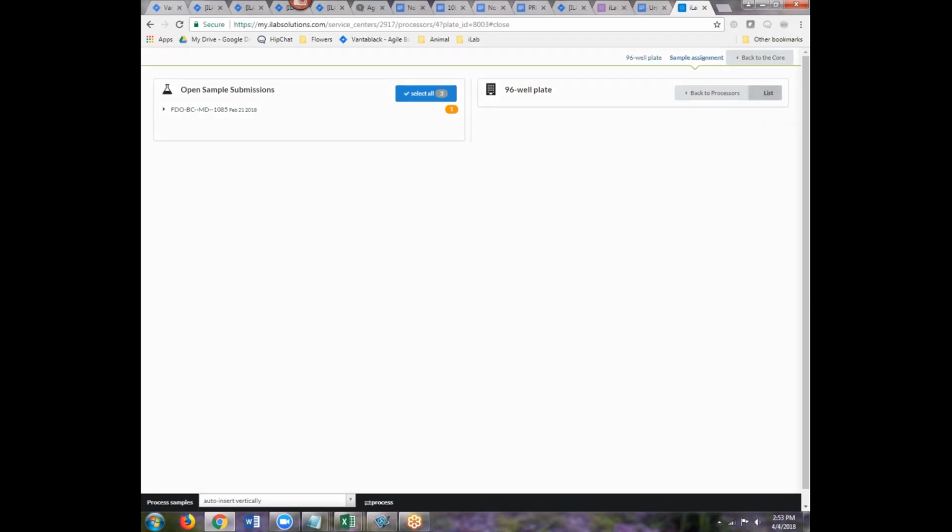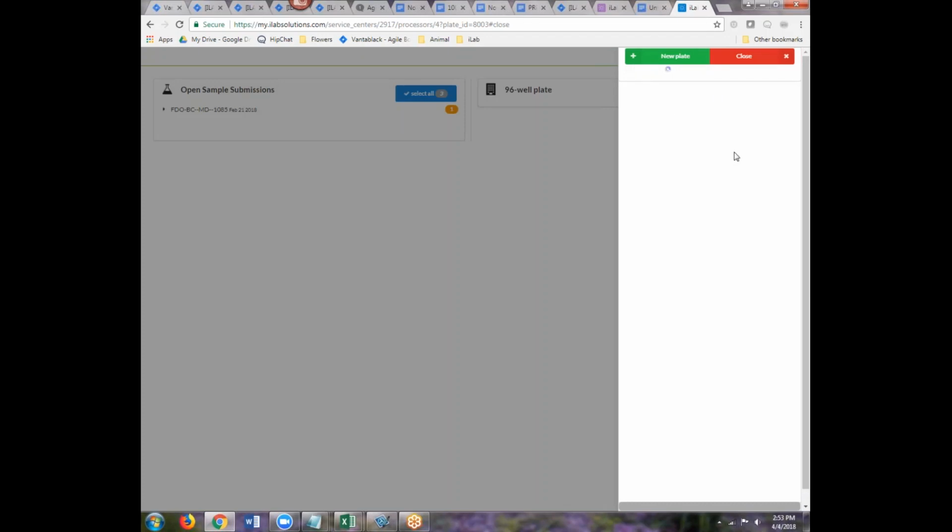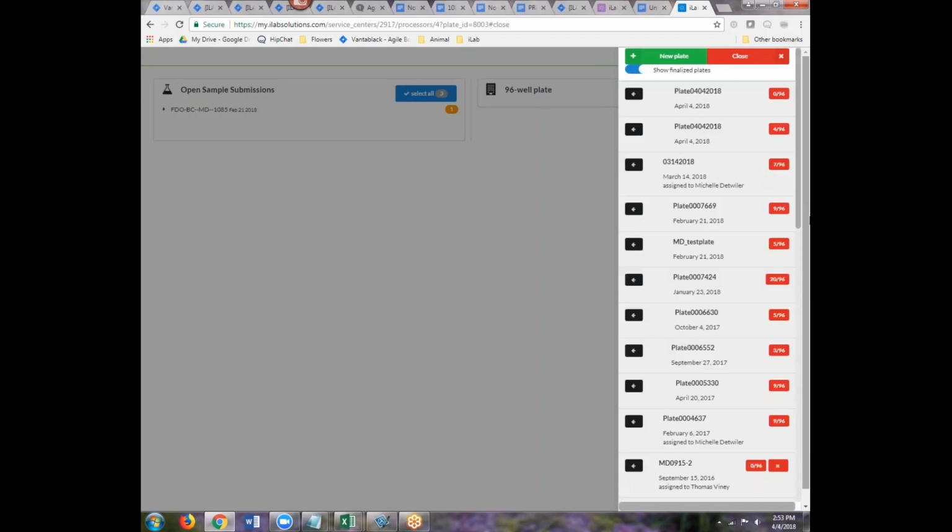And then it is not shown in the list anymore, unless we want to show finalized plates, and we can look at all the plates that we've worked on in the past.